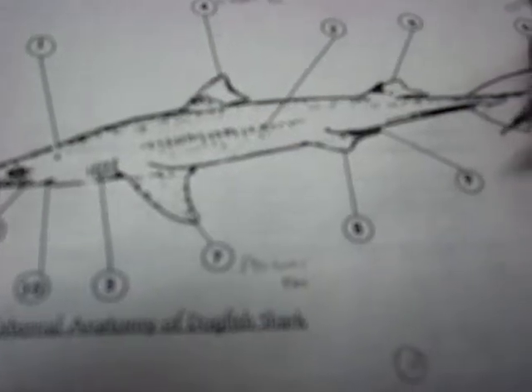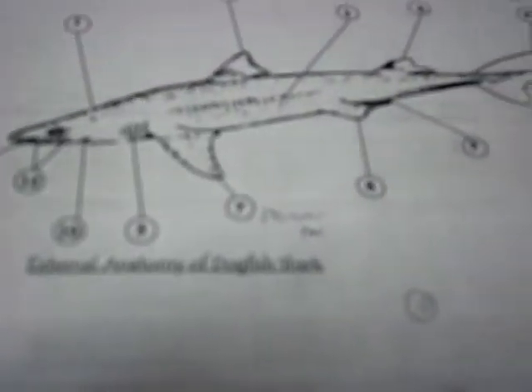These are claspers. You guys have that right, but what are these fins? What is Elvis shake? Pelvis. His pelvis. These are his pelvic fins. Okay, pelvic fins. And then these paired organs between the pelvic fins are called claspers. Good. So if this guy has claspers, what does this make him, a male or a female shark? Male. This is a male shark. Good.